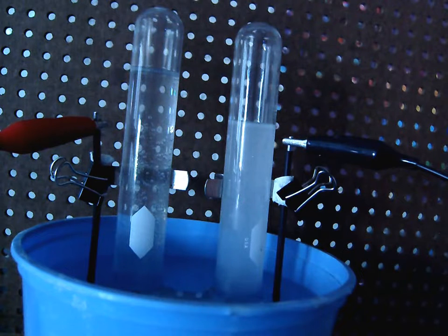And then if we took something similar, like a popsicle stick that was on fire but that we blow out, but where it's glowing a little bit, we call it a glowing splint. If we took a glowing splint and we put it inside the test tube with the oxygen, it would reignite itself, which is pretty impressive too. So we could use that particular test. We'd be testing the flammability of the two gases to identify the two gases.